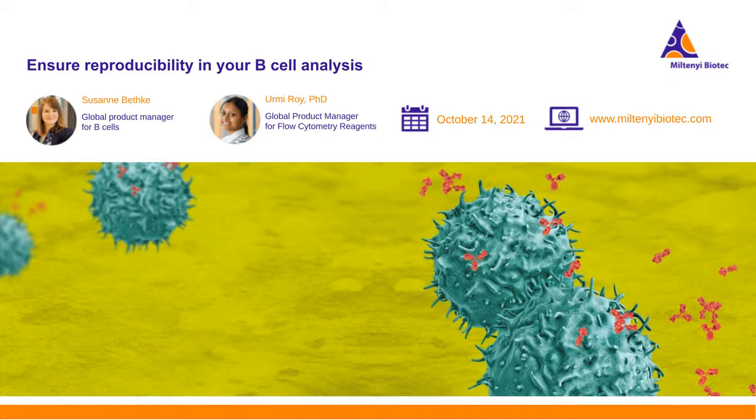Great, thank you. Our next question: can one use the MACS beads for enriching antigen-specific B cells?